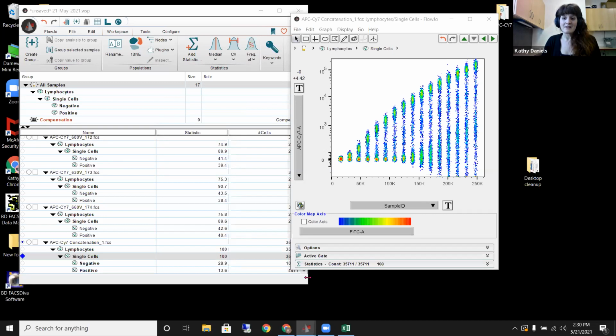You will see that there are educational resources that show compensation over 100 where you get nice populations that are pulling out. Not everyone might agree with me on that, right? Yeah, I know there are some people that have different opinions, and some people try optimizing voltages to bring down compensation, but that's not the approach to take. And we have some educational resources on that.